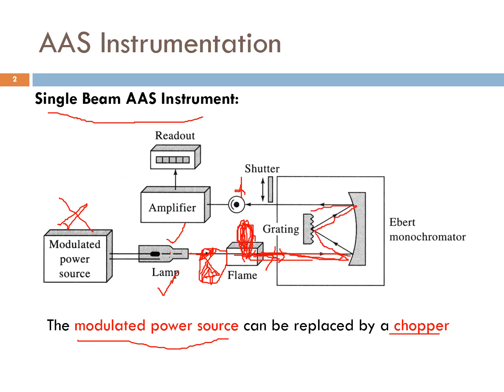Why go through the monochromator? Sebab kita nak monochromator here to select our desired wavelength yang telah diset oleh kita, and then dia akan go to the detector here, in which the detector ni akan convert the radiation to the analytical signal, and then this analytical signal will be amplified by amplifier, and then bacaan tu akan di display oleh readout kat sini.